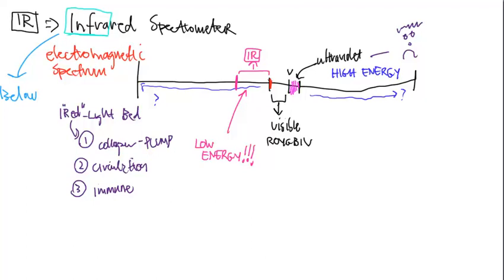So hang tight. You're going to go through a series of different videos on infrared. And the problem with this lecture is not the instrument. The problem will be interpreting an infrared spectrum. That's going to be the key to making it through this lecture and getting a good grade on this module. So bear with us, hunker down, get some caffeine, and I'll see you back in a few.